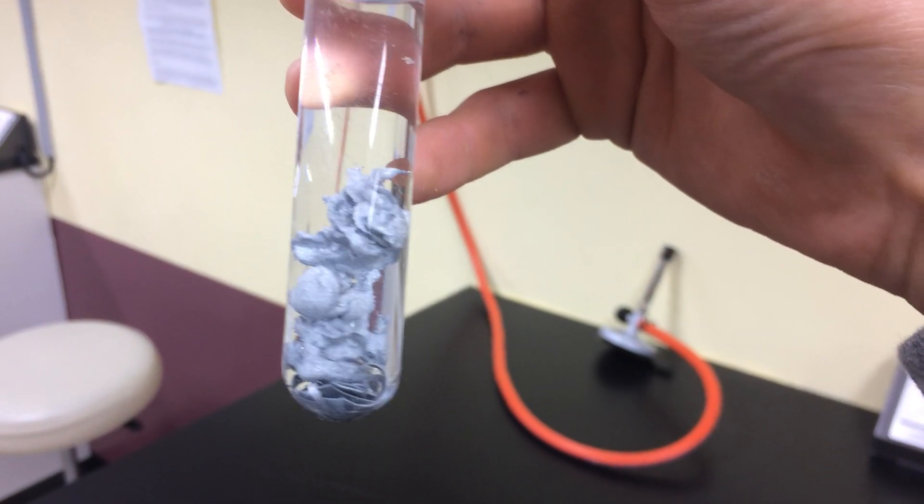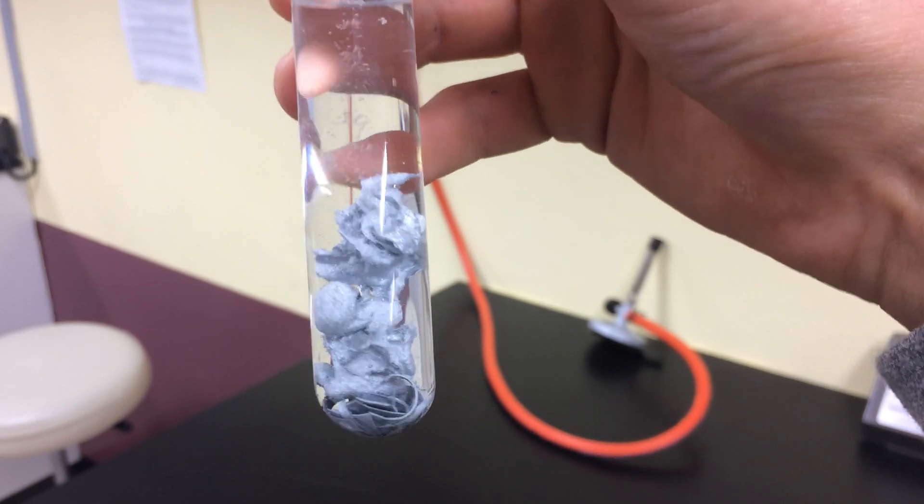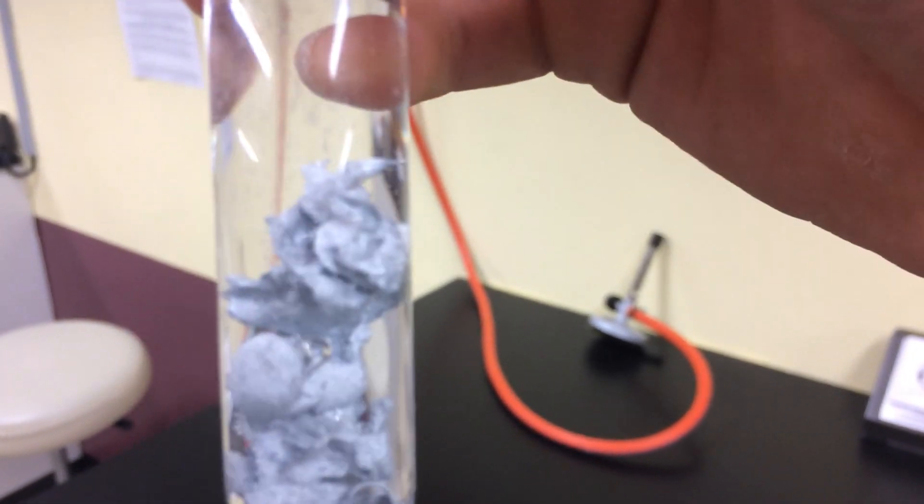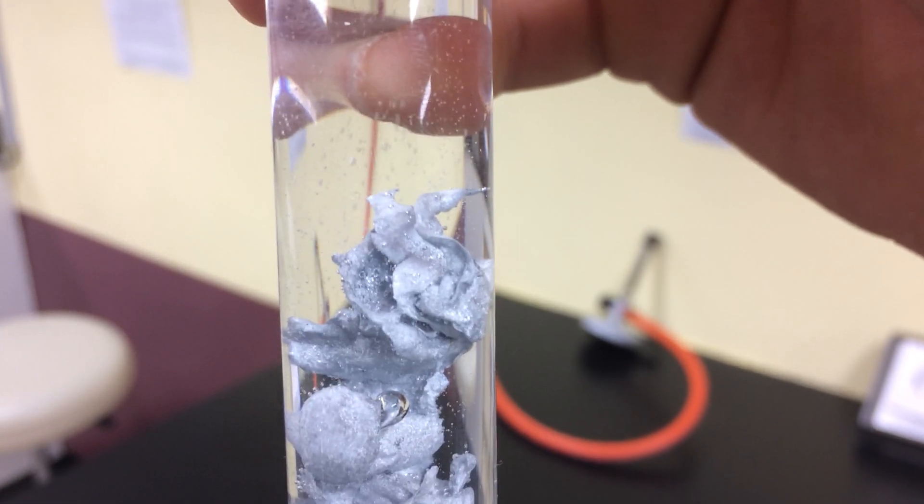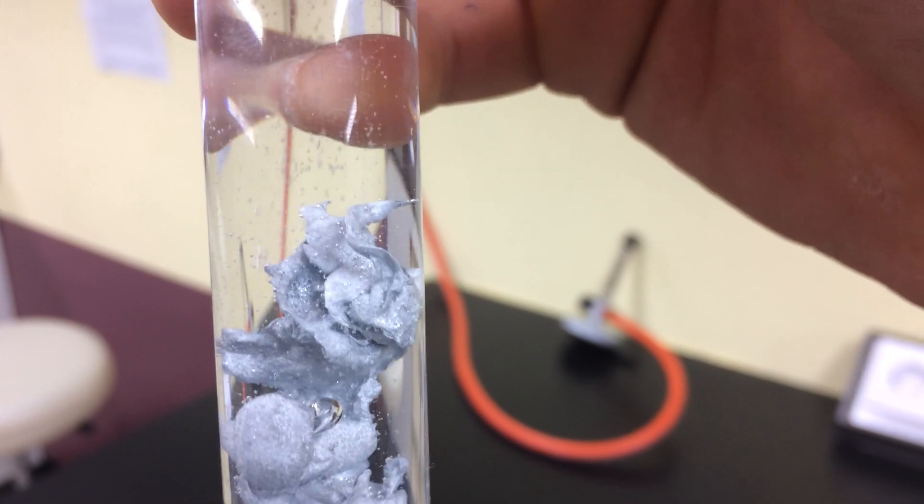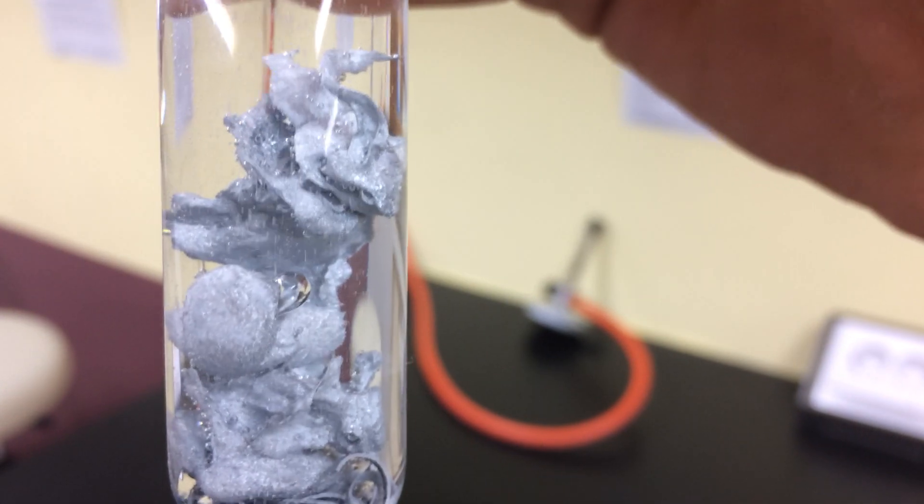Here you can see the zinc pieces reacting. If you look closely, you can actually see bubbles coming off. That is the gas, the H2 gas, the hydrogen gas that is coming off as a product when the zinc reacts with HCl.